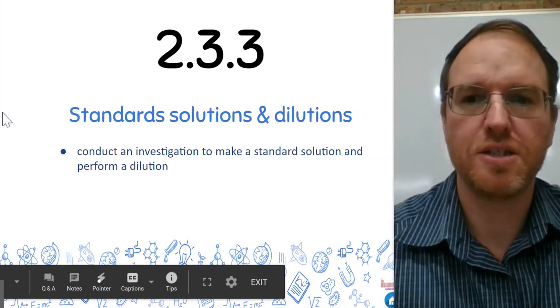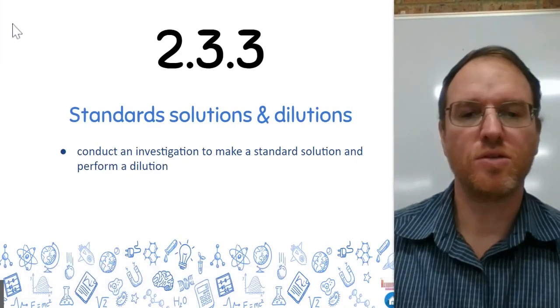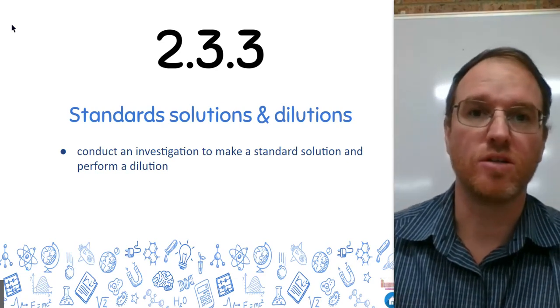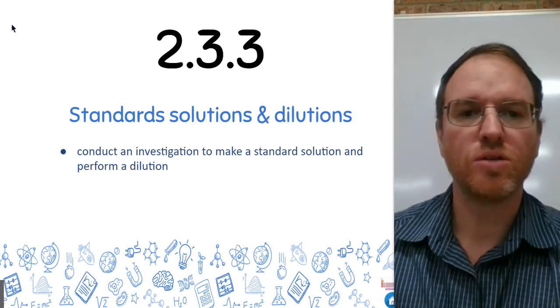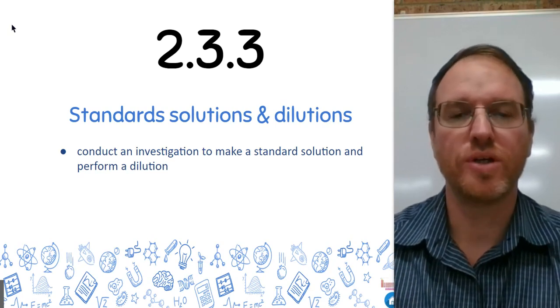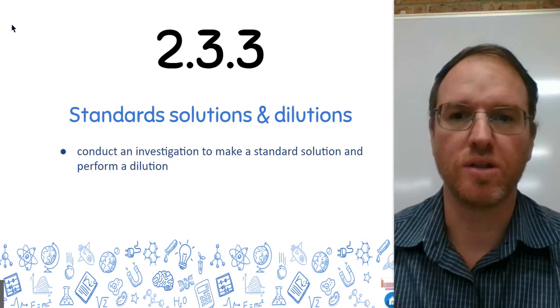Hello everyone. In this video, I'm going to explain to you standard solutions and especially the equipment that we use for measuring standard solutions and why they're so important. We won't look as much at dilutions, but as part of this dot point, you do a dilution as well.